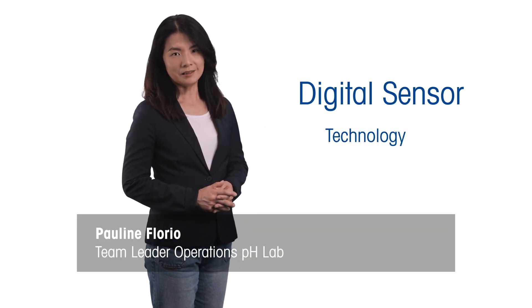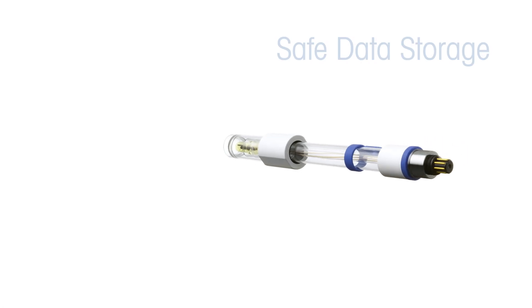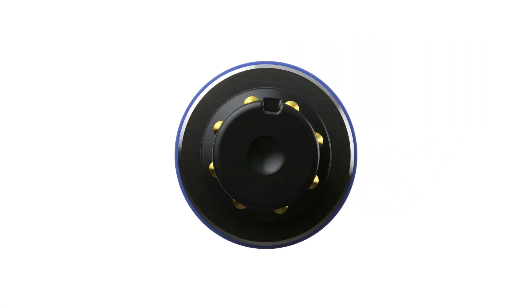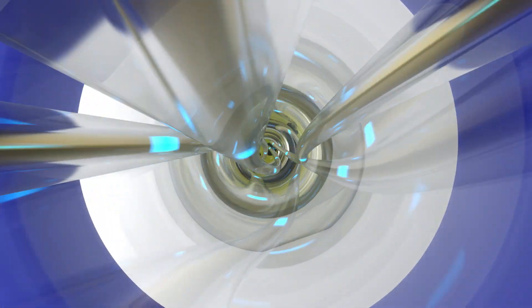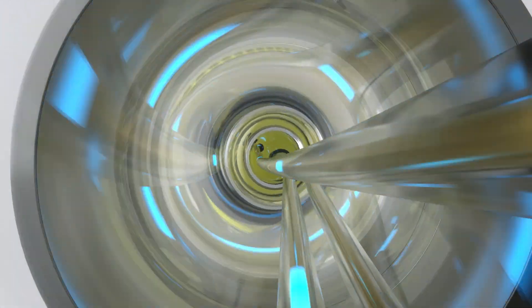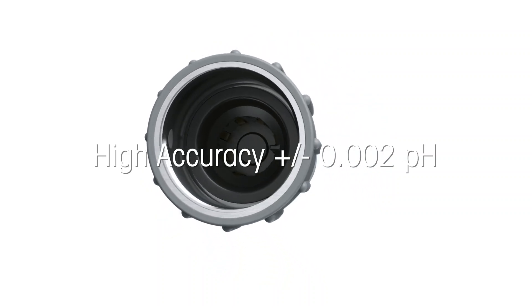At the heart of the 9Focus system is new digital sensor technology. We built it to work smarter and streamline your workflow. The sensors don't just measure — they store and manage data for simple retrieval. The sensor chip continuously communicates with the meter, saving your time and ensuring full data traceability. They are recognized automatically without a complicated setup. And because the system is designed for the highest requirements, it picks up even the smallest pH change with an accuracy of ±0.002 pH.